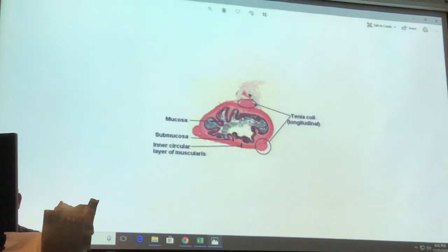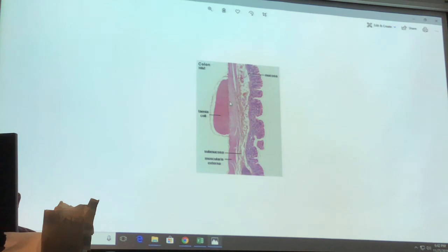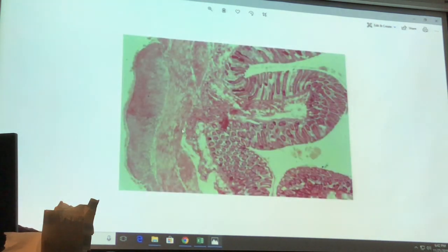Here's a slide, a cross-section of the large intestine, just focusing on the teniae coli. So you can really see what those extensions are. Here, low magnification. Here's high magnification. I think this is a neat slide because here you can see, here's the serosa. And the serosa is surrounding those extensions. Here's the muscularis layer. And note how this literally is just an extension of the muscularis. It's just pushed out and thickened in this area. Okay, and again, teniae coli here.